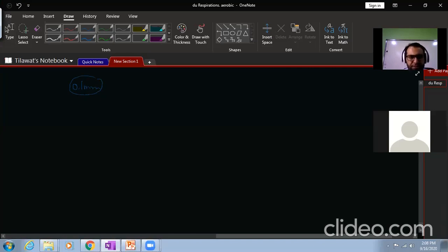It depends on the person, like 0.1, 0.8, but usually 0.1, if it is decreasing, a person can't see the thing. So for this limitation, we will face a problem if we are dealing with such small things. So what do we have to do about that? Definitely we will move toward microscopy, the way through which we are increasing the apparent size of an object. Apparent means not the real, but it seems to us like that.